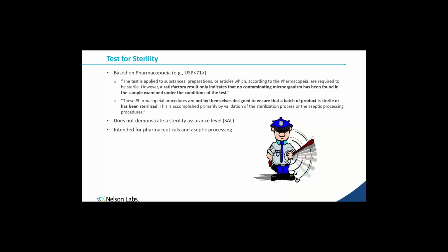That's usually going to have gone through some sterilization process of its own, such as filtration sterilization or maybe some form of heat sterilization. But what is happening is I'm taking these two then-sterile products and combining them together in a sterile way to maintain that sterility.